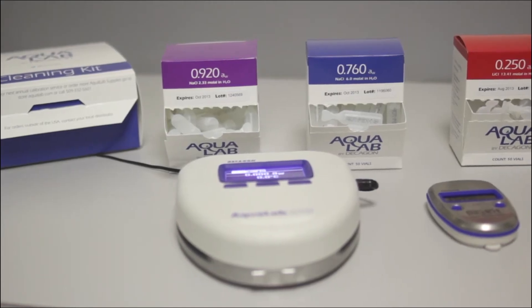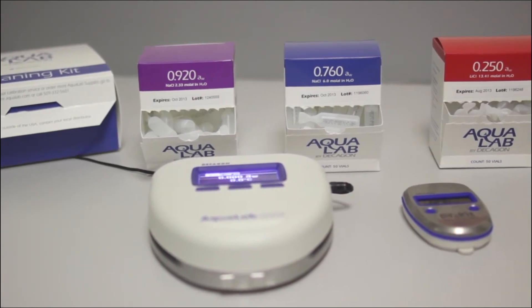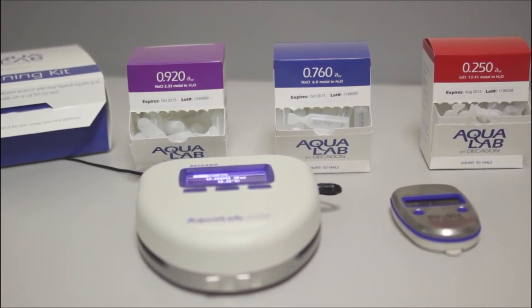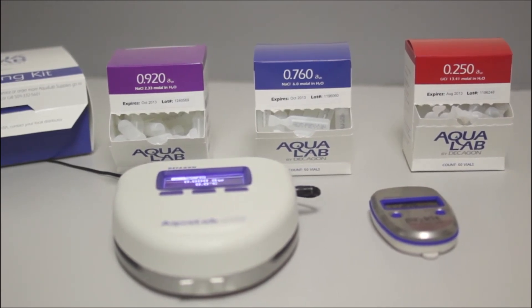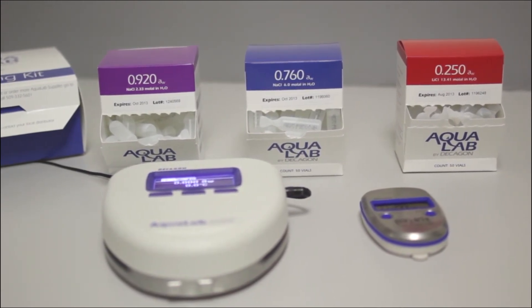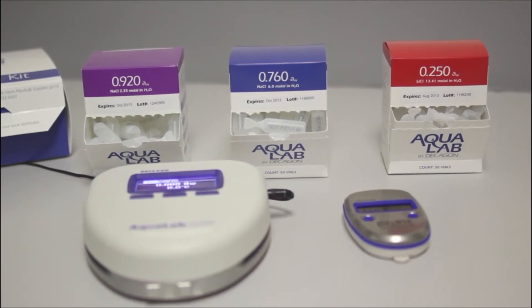After cleaning and before testing product, you need to verify your instrument with two verification standards. With the pocket and the light, there are only three verification standards out of the six we sell that you should use. The three standards are the .920, the .760, and the .250.